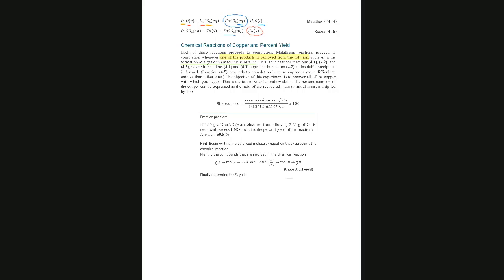So basically, we are going to observe a black-brown precipitate of copper. And what happens with the solution? We had a blue solution, we said, but the solution becomes colorless. Why? Because we have now zinc sulfate. We don't have any more copper sulfate. All the copper is free, it's in the beaker as a metal, as a solid.